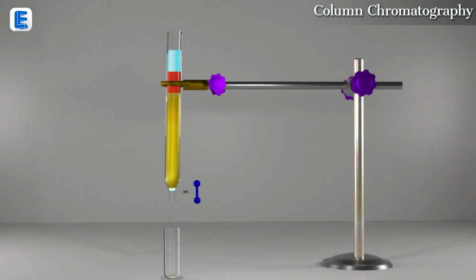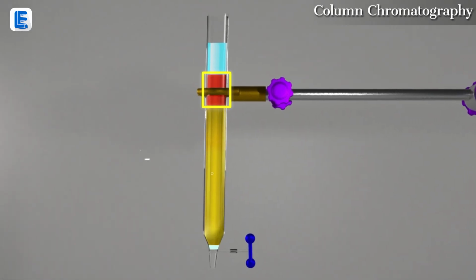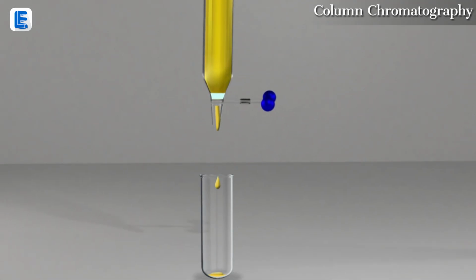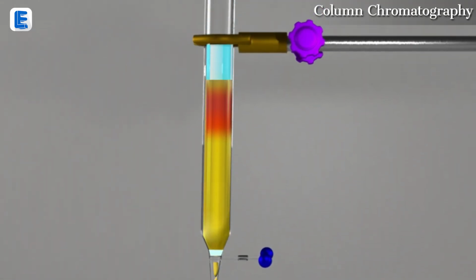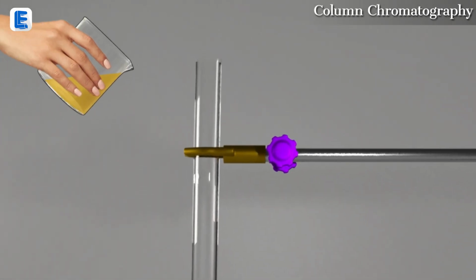Column chromatography. In this chromatography, the components of the mixture are placed on the top of the adsorbent packed in a glass column. A suitable eluent, which may be a solvent or mixture of solvents, is allowed to flow slowly from top to bottom through the column. Then the components of the mixture get separated due to adsorption at different levels. Column chromatography works in some stages.